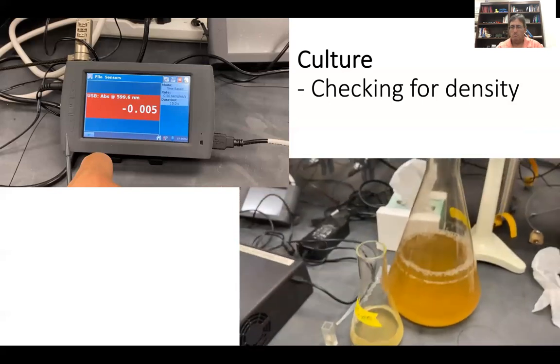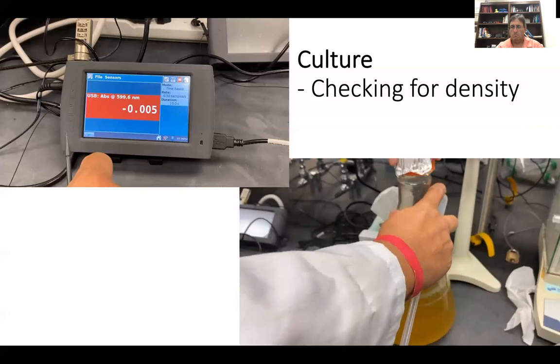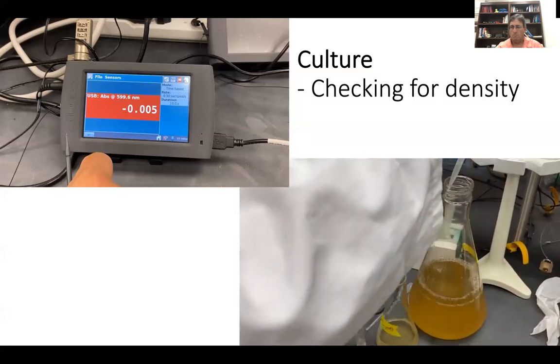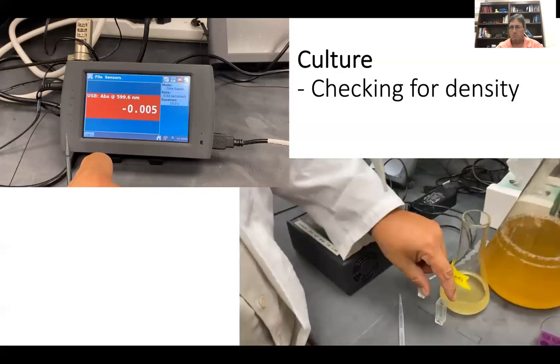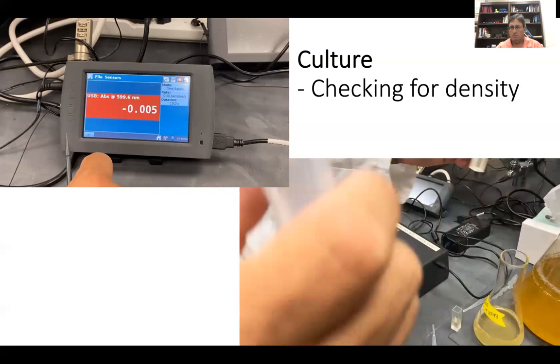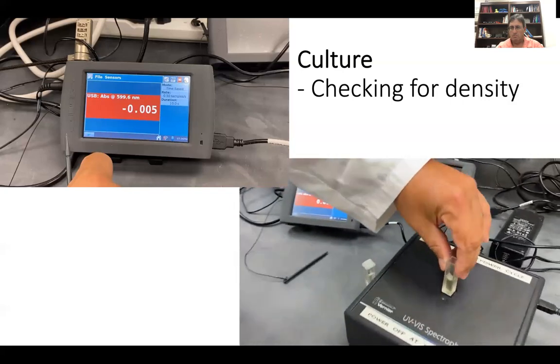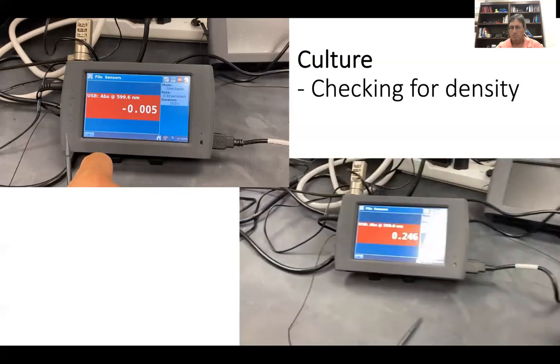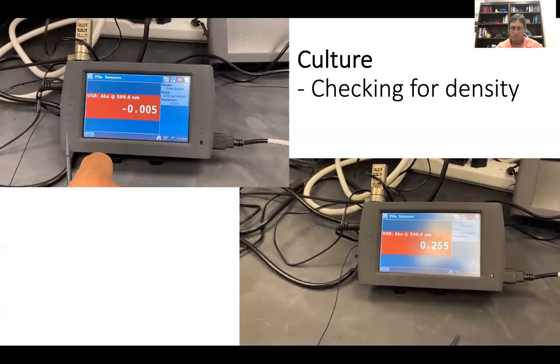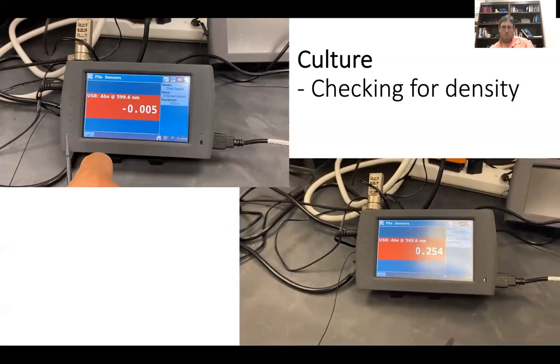Now let's check our bigger culture. Again, when we're done with this, all the plasticware will be rinsed with bleach. This one's a little less dense, so this has got to go for a couple more hours. And so each time you do this, that's what you do.